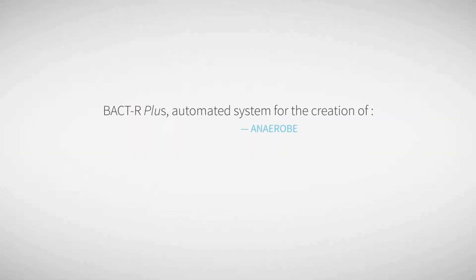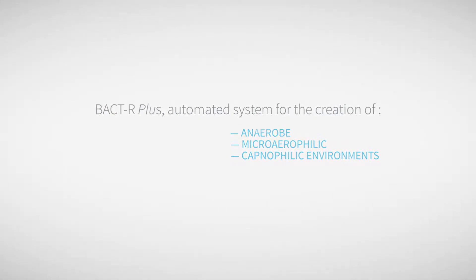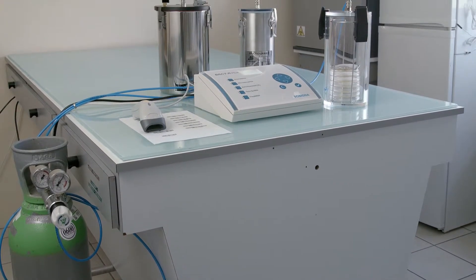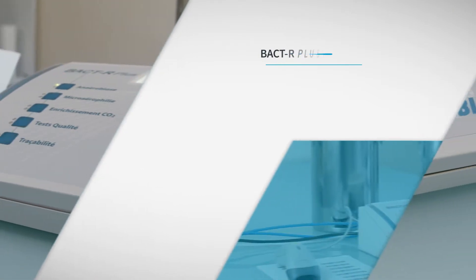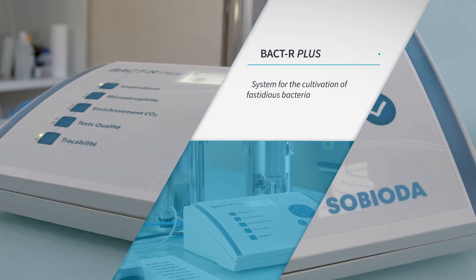BACDAR Plus system is used for the automatic creation of atmospheres in jars for anaerobe, microaerophilic, and capnophilic bacteria. The system includes the device BACDAR Plus, Plexi jar or stainless steel jars, one vacuum pump, gas bottles, mixture or CO2.